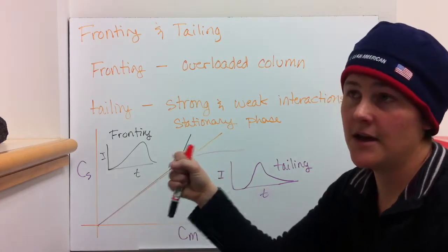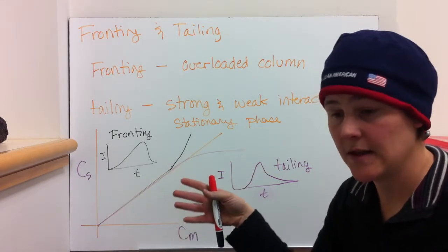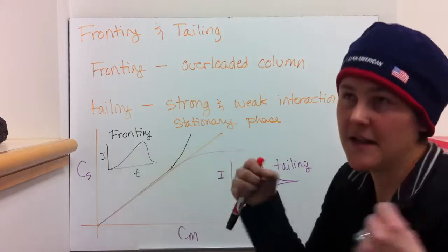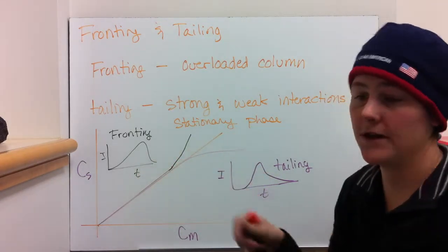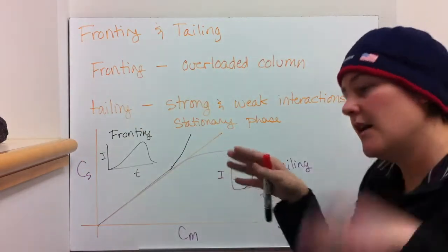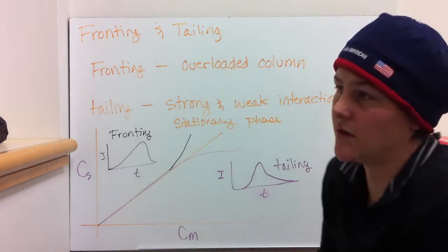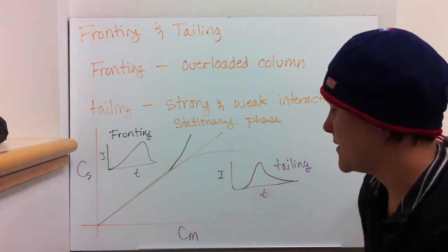Basically there's a lot of weak adsorption sites, and just a few really strong adsorption sites. If a solute comes in and gets stuck in one of those strong adsorption sites, it takes much longer to get away. Whereas the rest of the adsorption sites are like, oh hey, sorbed, desorbed. Okay, I'm traveling down the column, sorbed, desorbed. If you get stuck in one of these where you're sorbed, it takes longer to desorb because the interaction is stronger. So that's what can happen when you have tailing.